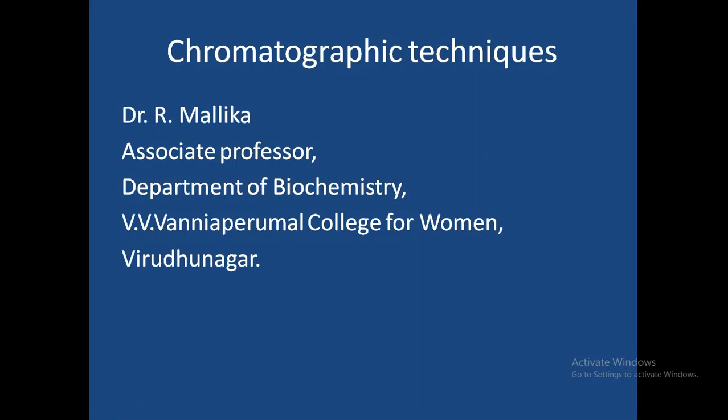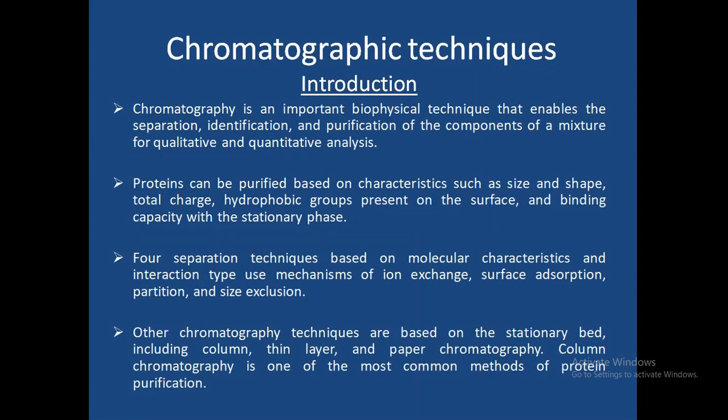Today, let us see the chromatographic techniques. Chromatographic techniques are widely used techniques which are used to separate and identify the compounds present in the unknown sample or mixture. Let us see the introduction first.